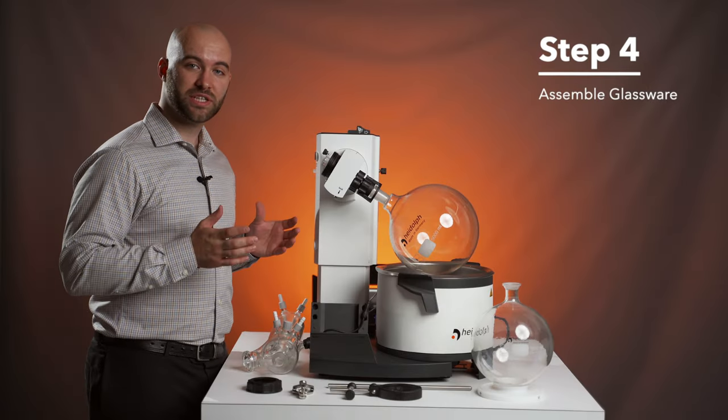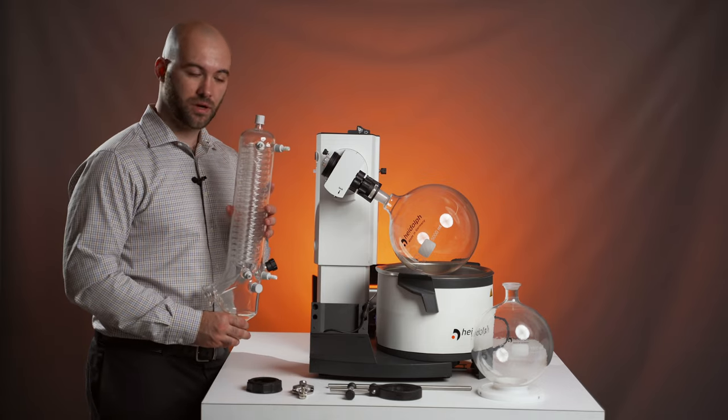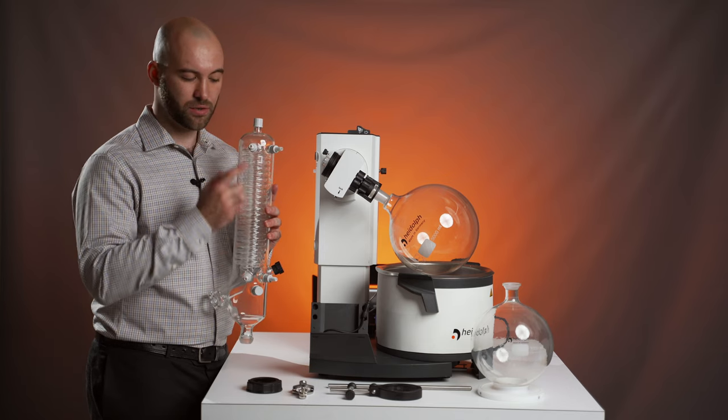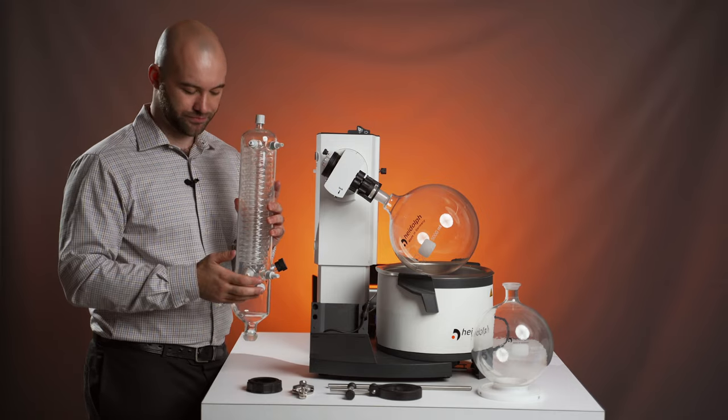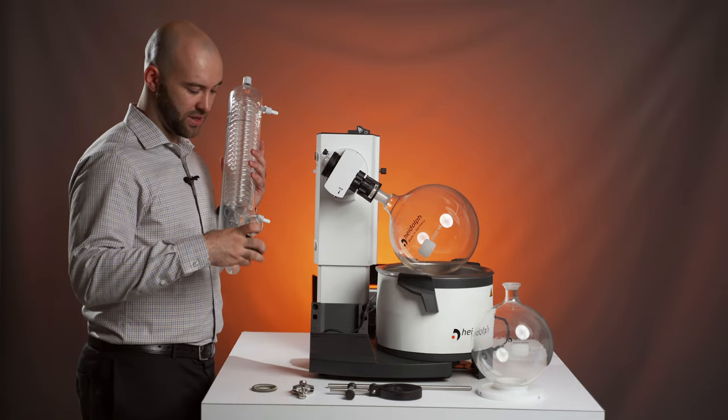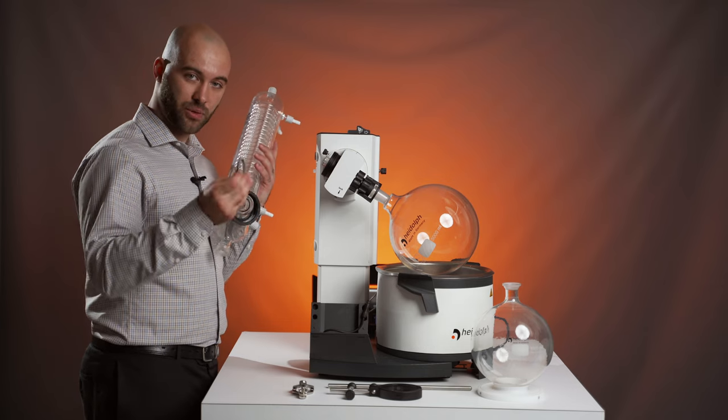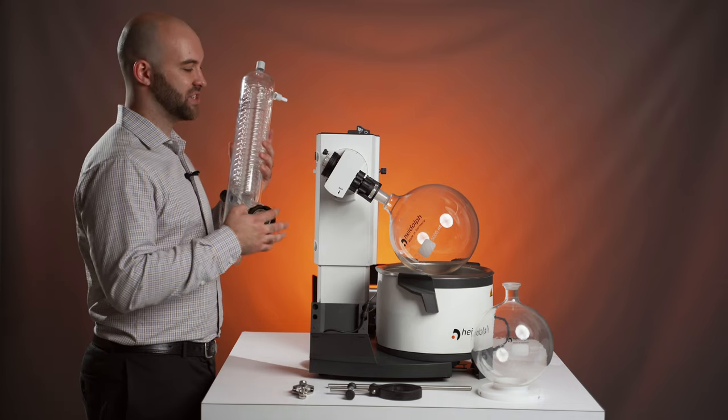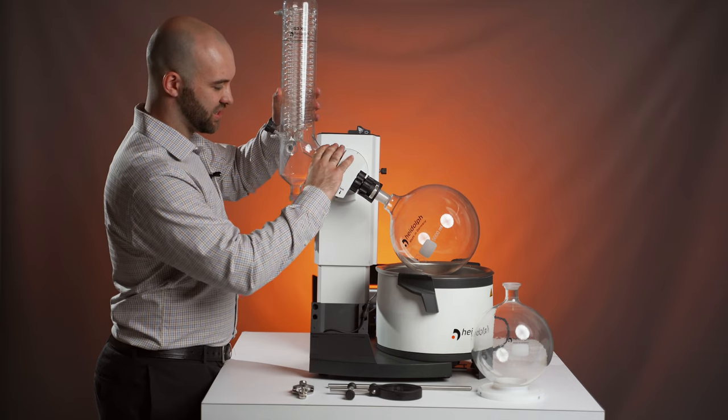Step four, we will be assembling the glassware on our HiVap. We'll start with our G3 XL condenser. From the box, you're going to want to make sure you have attached four GL14s with barbed connectors and two GL18 caps. Once that is done, you will take that screwing clamp that we removed in the last step and slide it over this connection. Following that, the tension spring that was included will go around to prevent it from sliding off. You'll take that and connect it to your drive.